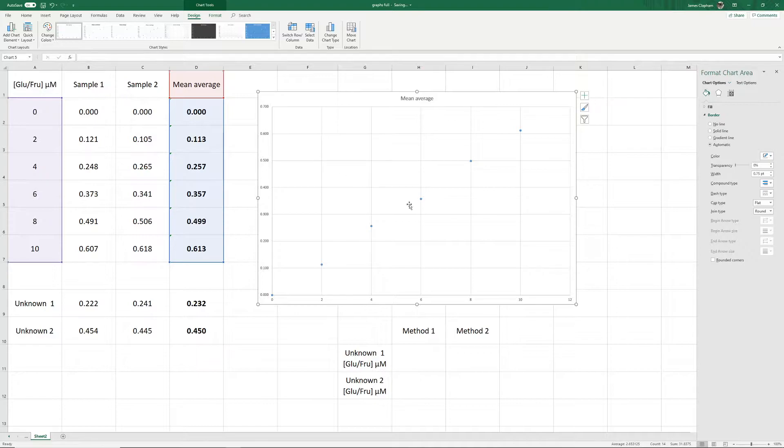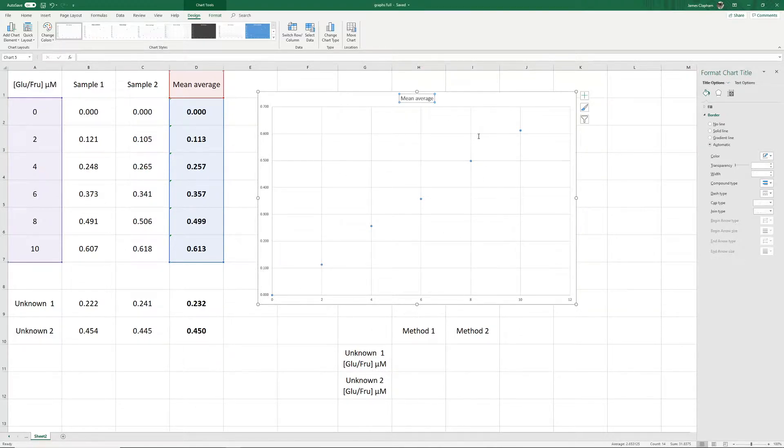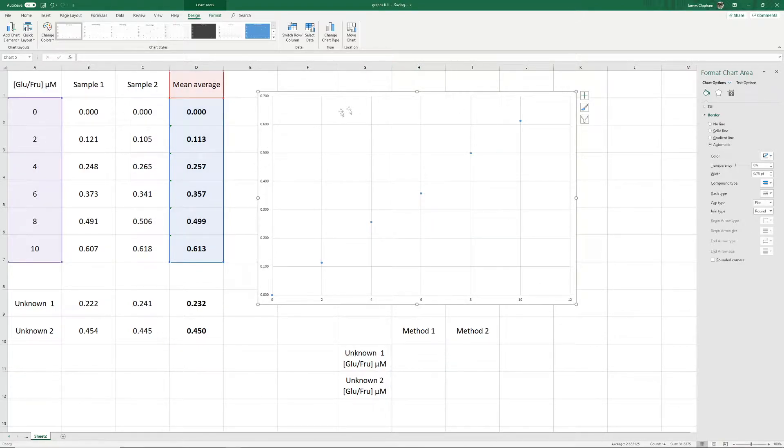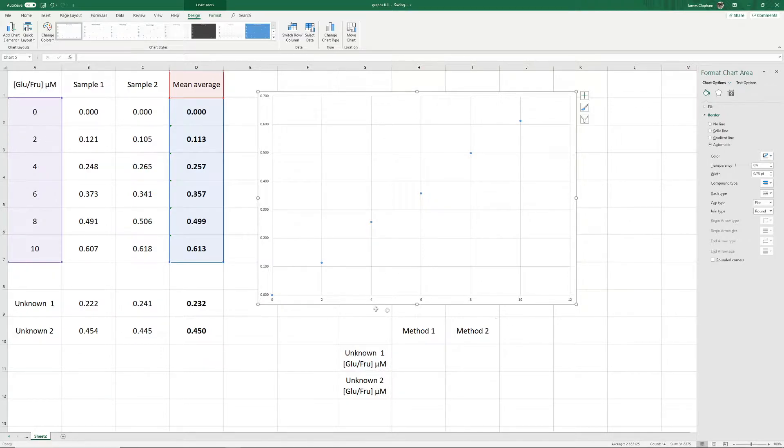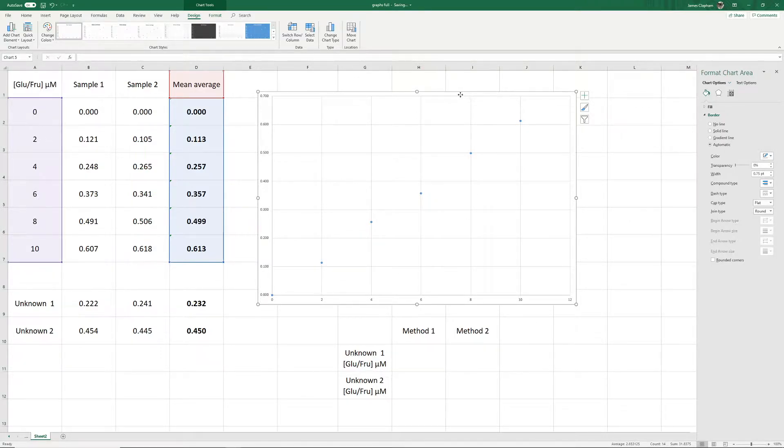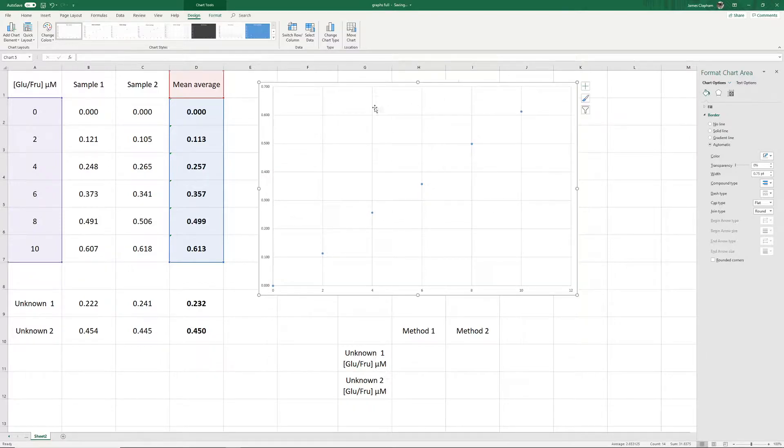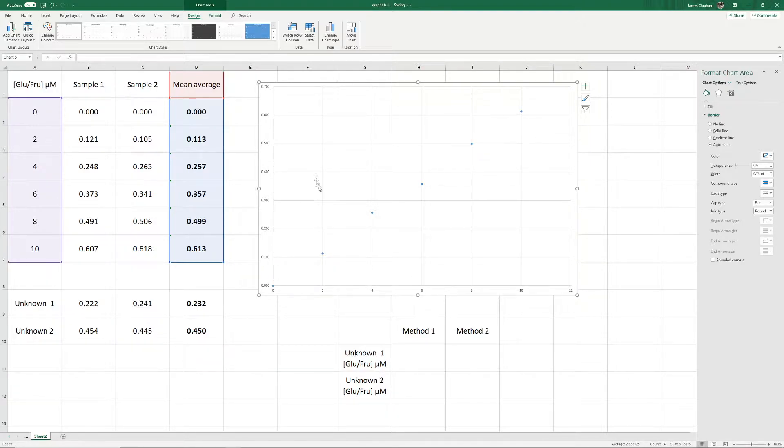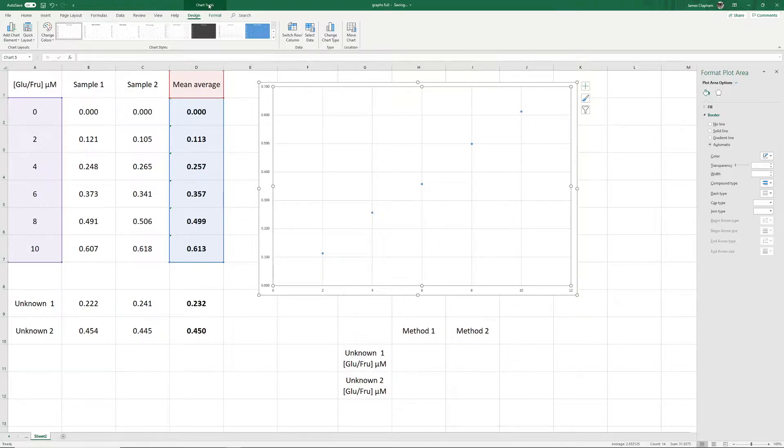Now before we do anything else, we need to clear up a few things. First, we want to get rid of the title here. Excel always likes to put a title at the top. When we put this figure into our work, we always put the title in the caption, which will go at the bottom. The second thing is that Excel doesn't give us any titles for our axes.